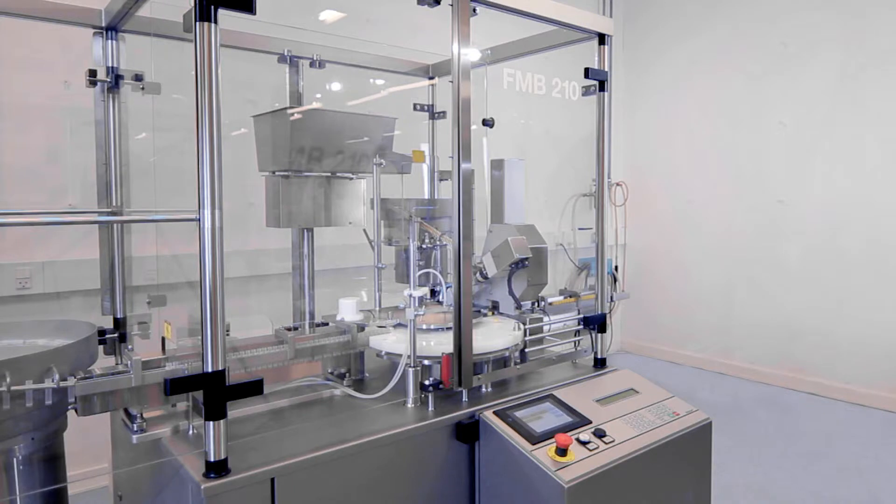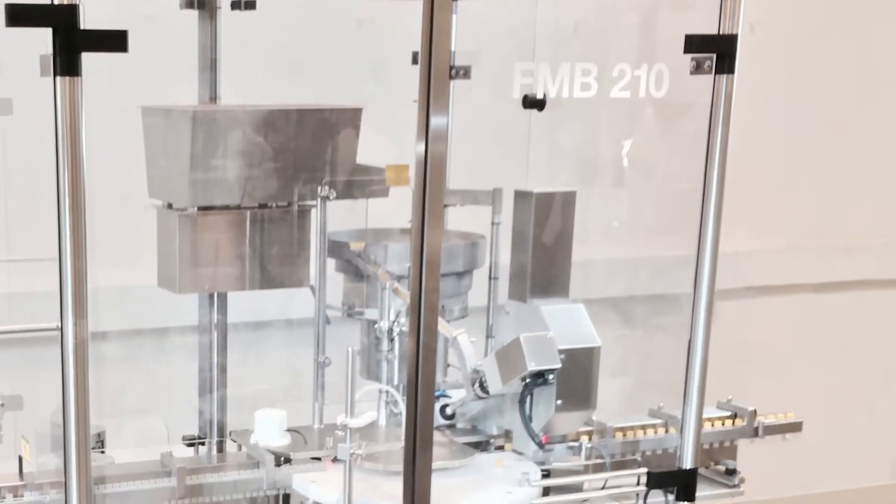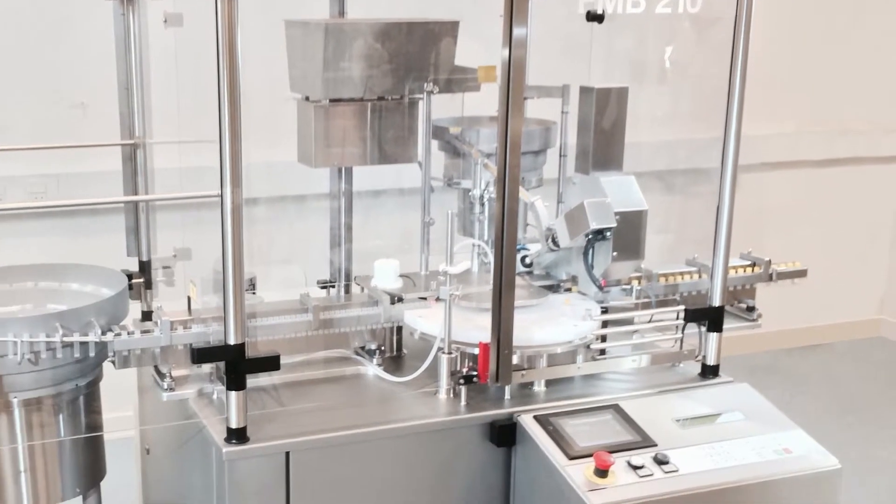Flexicon offers IQOQ for the equipment and provides a free validation pack for the fluid path, reducing the time and resources needed for validation.